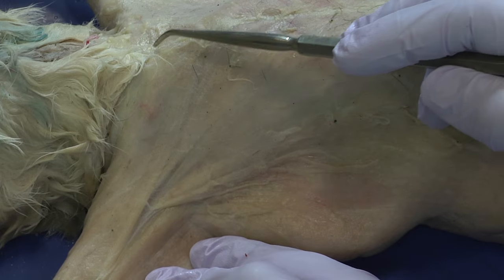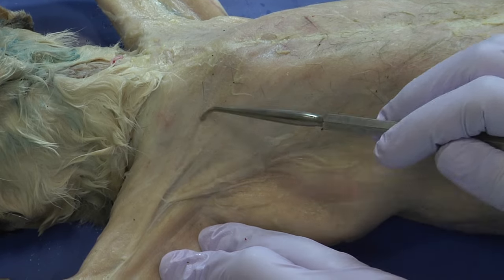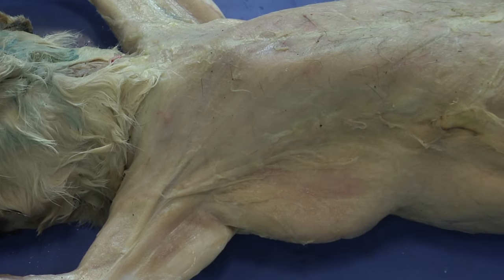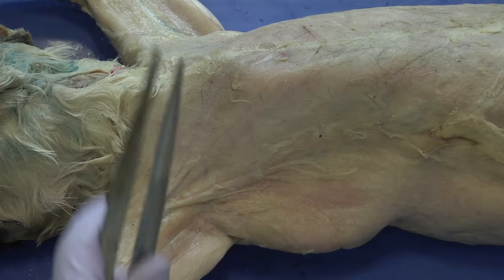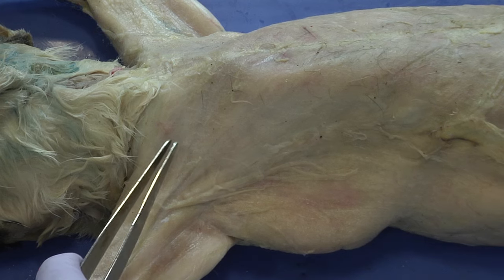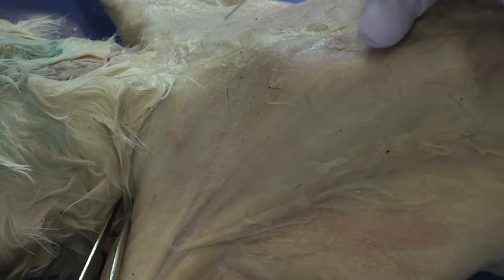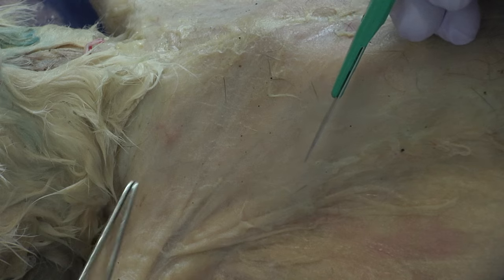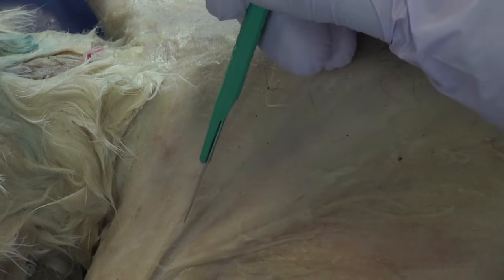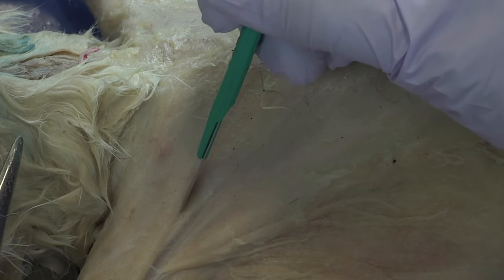We never want to cut along the point of origin or insertion — always along the side of the muscle, parallel to the orientation of the fibers. I'll now take the scalpel, being careful because these are very sharp, using the forceps as a grip and keeping fingers away from the cutting area. In one smooth motion, I'll create a line following the natural separation between the two muscles, applying a little more tension in the muscle and making the incision.